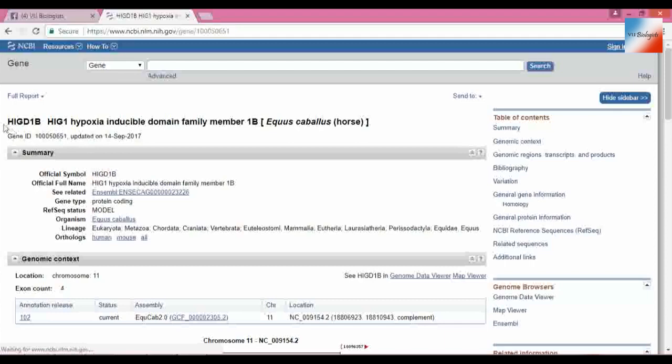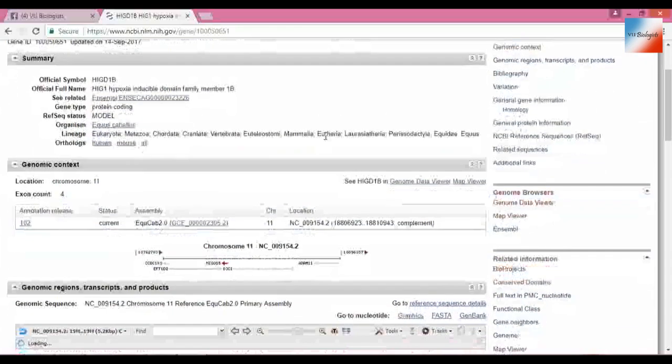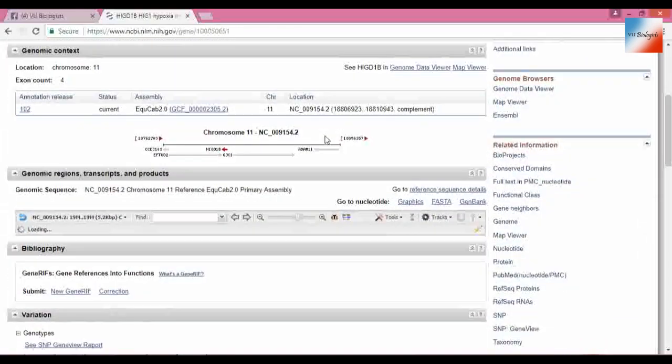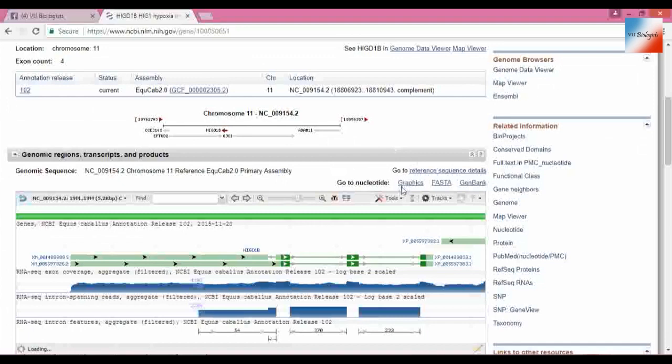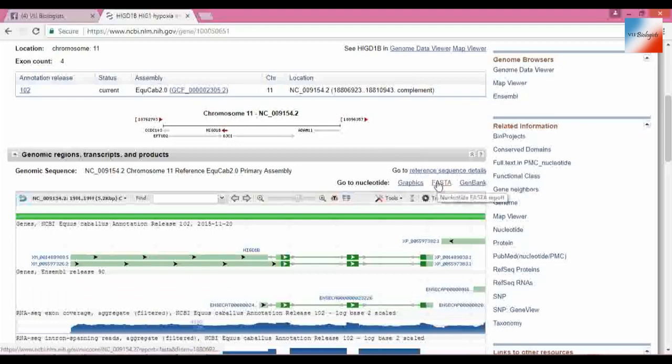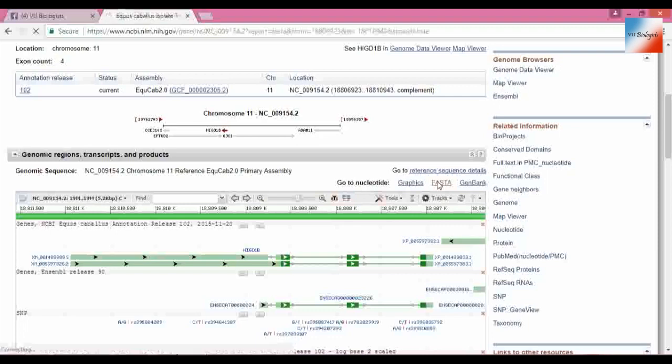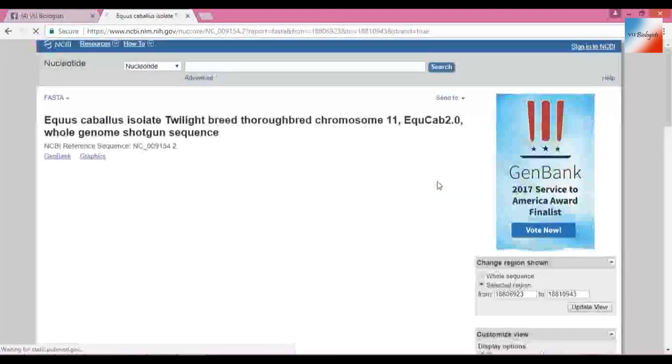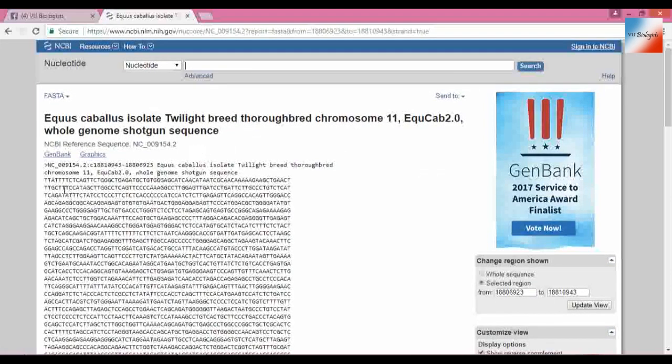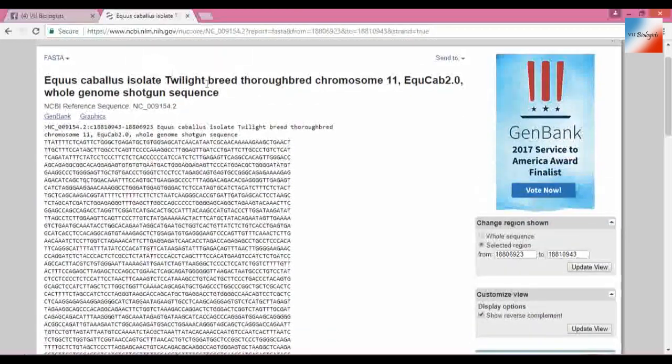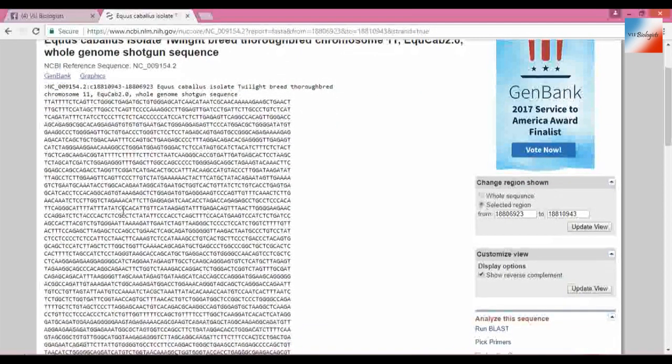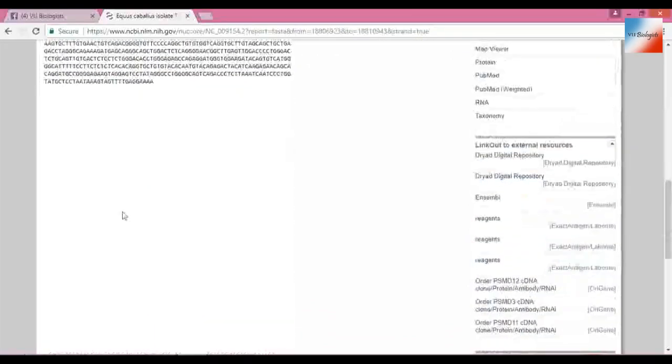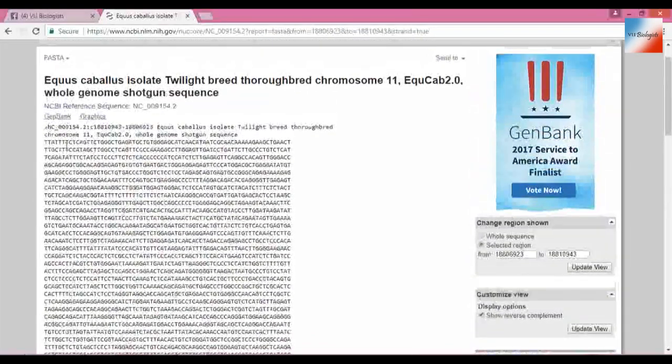And here is our gene, hypoxia-inducible domain family member 1B, Equus caballus horse. How to find sequence? Scroll down, you will find that there is a graphics section. FASTA from GenBank. We need the whole sequence in which the introns and exons are both present. And here is the whole sequence. Let's give a wide detail, the whole gene which affects the hypoxia in the horse. So this is the gene sequence, that's how we get sequence from NCBI.